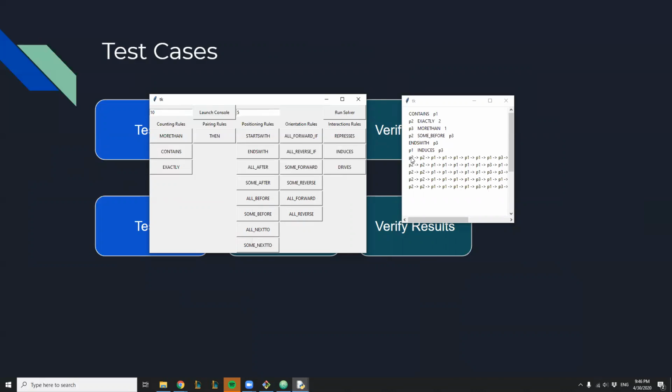And here we see 5 sequences, as we input onto the text box here. And each one of them is exactly 10 parts long. So we can see that these two constraints we set up at the beginning of the test hold up together within the system.